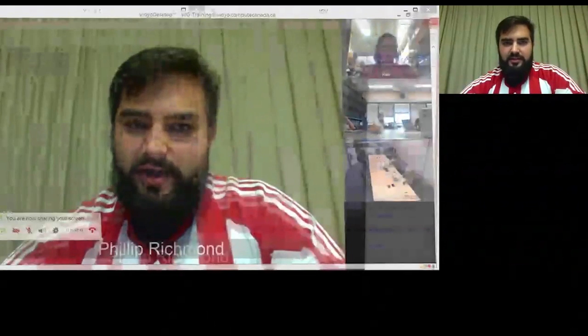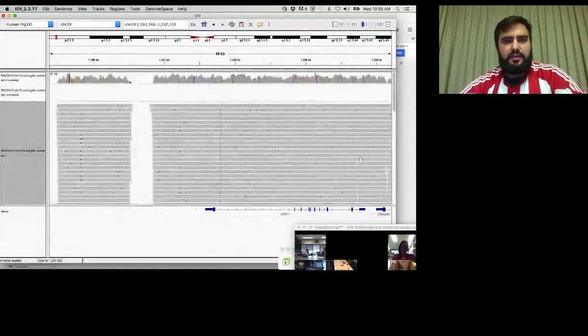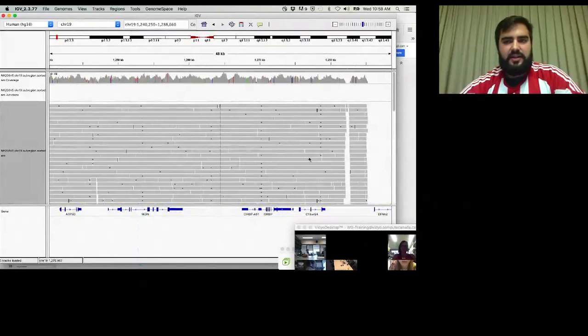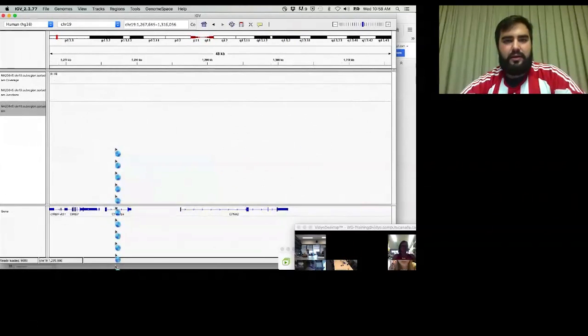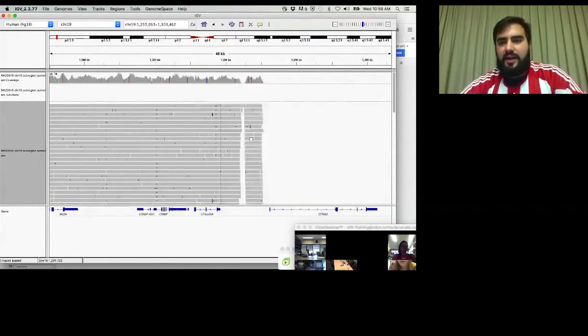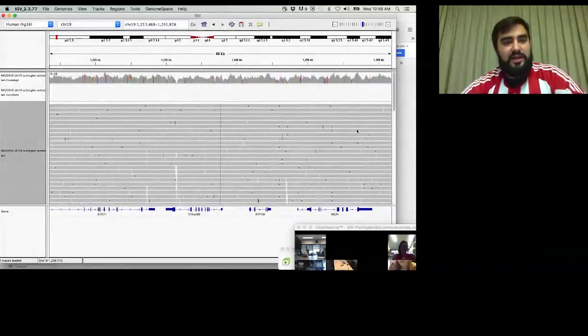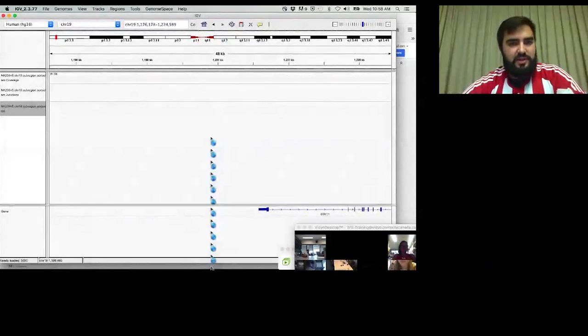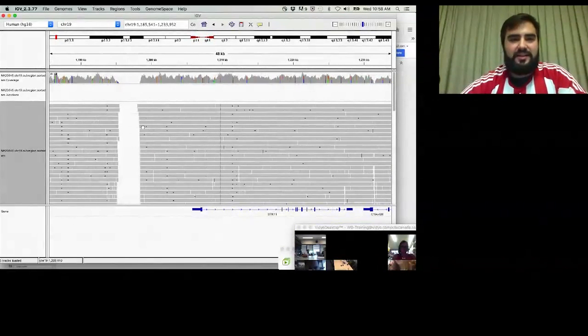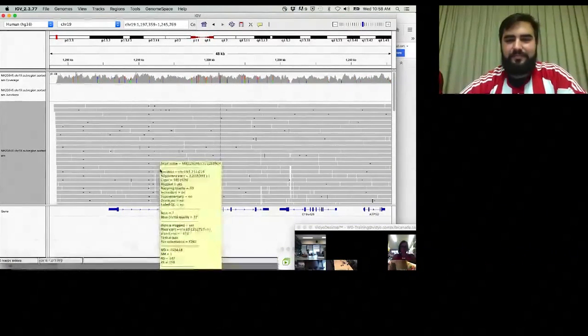Again, zooming in and zooming out, very simple. And yeah, the region that I have sub-selected for us is quite short, so if you go beyond the bounds of this region, you can see there are no reads, and that's just so that these files are manageable. If we were dealing with whole human genome BAM files, then this workshop would take several weeks.